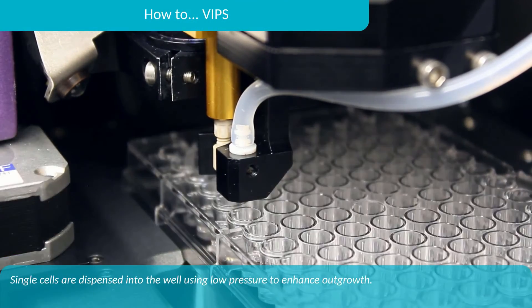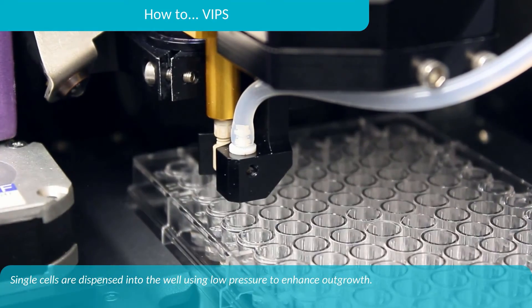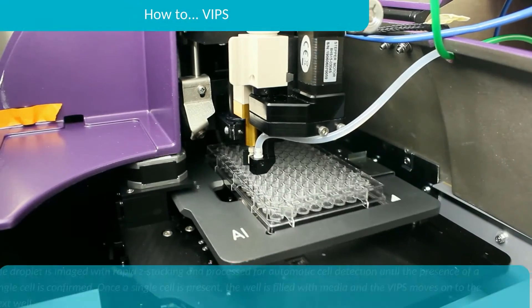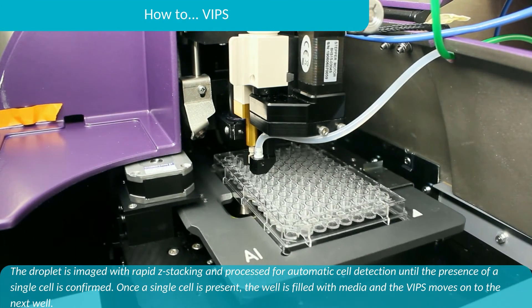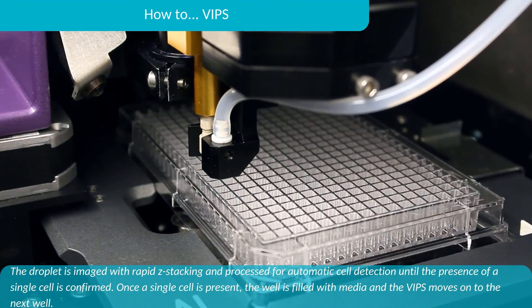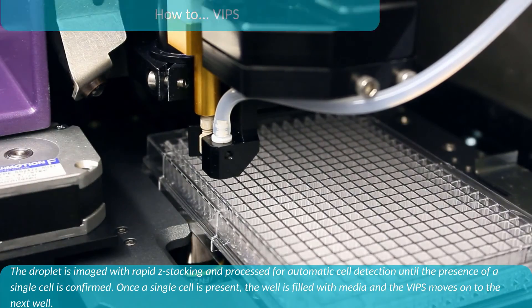Single cells are dispensed into the well using low pressure to enhance outgrowth. The drop is imaged by rapid Z-stacking and processed for automatic cell detection until the presence of a single cell is confirmed. Once a single cell is present, the well is filled with media and the VIPS moves onto the next well.